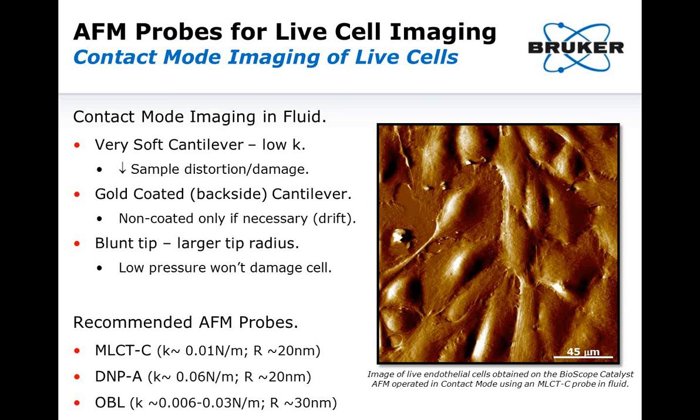Imaging live cells does not require the high resolution that the molecular imaging did. Here it is more important not to damage the live cells. The lower pressure afforded by the larger tip radius is ideal. The recommended probes for this application would be the MLCTC, the DNPA, or the OBL probes.